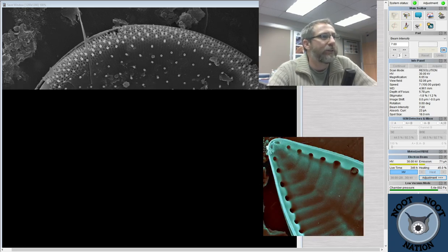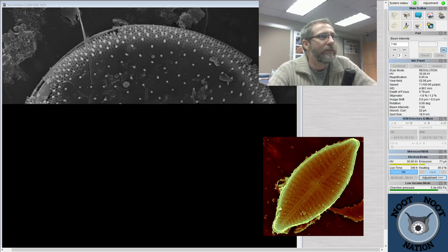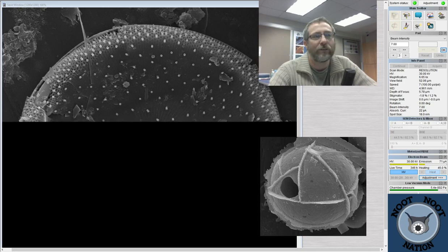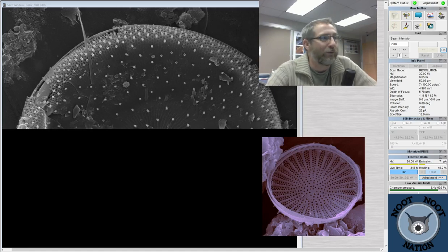First time watching, what does the sample look like these images were taken from? So the sample came from a plankton tow that Pacific Plankton collected. It looks like brown, soupy sort of gunk before we start in macro view.